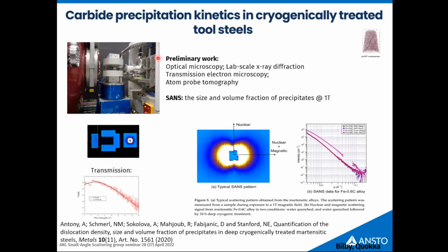And when we're working with steel, again, we have a magnetic and non-magnetic matrix, and we are able basically to distinguish between magnetic scattering. So we really can say quite a lot about the size distribution of the impurities in the sample, looking at both magnetic and non-magnetic components. And this is just a typical shape of scattering. So we're getting two-dimensional scattering. All I want to say is, because it's not symmetrical, it means in one dimension we have only nuclear scattering, in another dimension we have the magnetic component involved as well, which gives us a lot of information about those impurities.